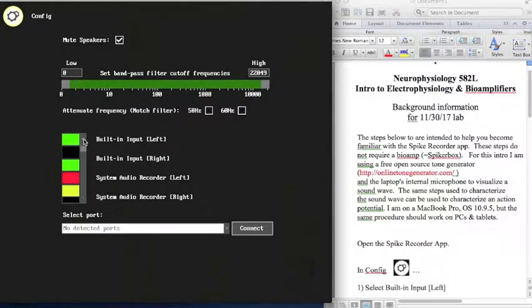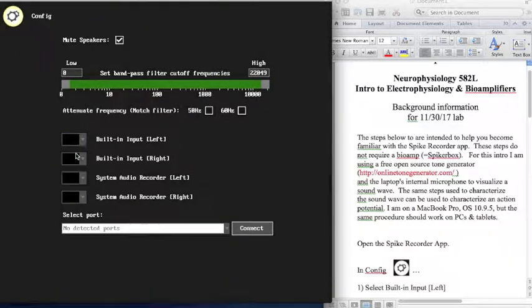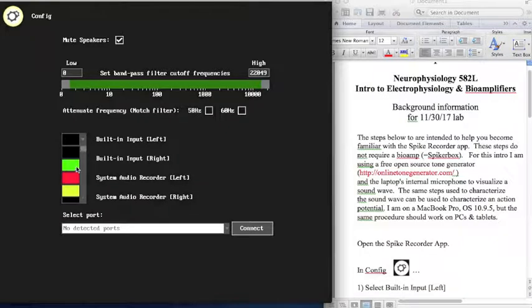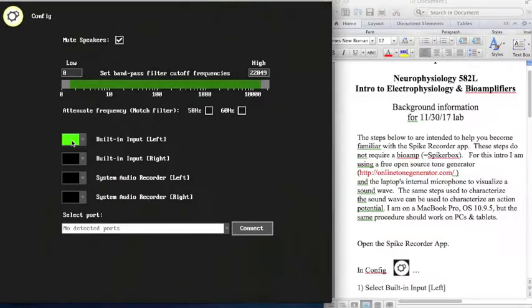In this case, built-in input left has already been selected. If I wanted to deselect built-in input left, I would click on the black square, and now no inputs are selected. I'm going to choose the green square again. That green square will also be the color of the trace on the live screen. After you've selected a colored square from the built-in left mic, return to the live screen.